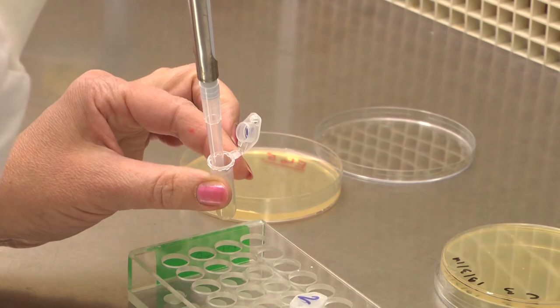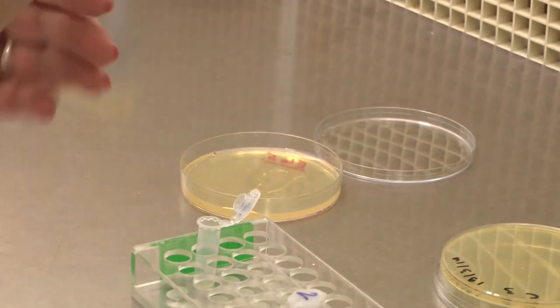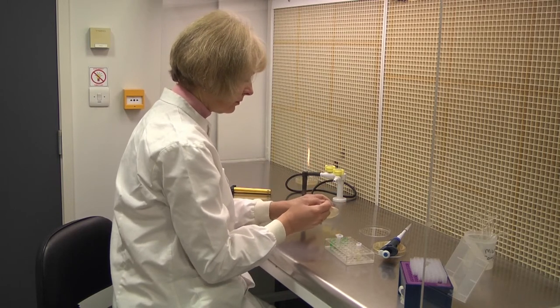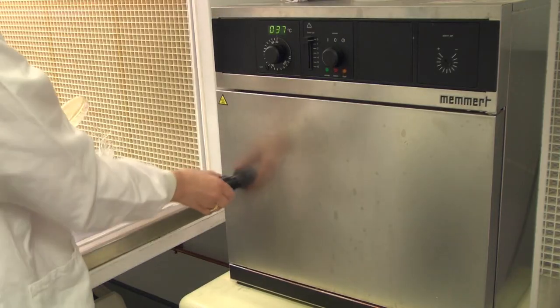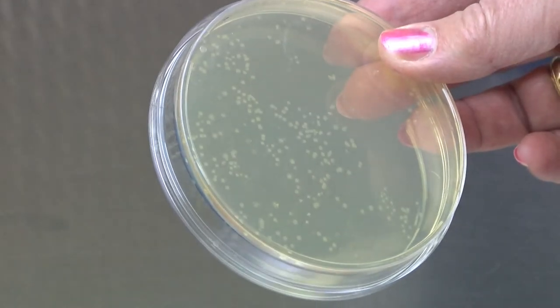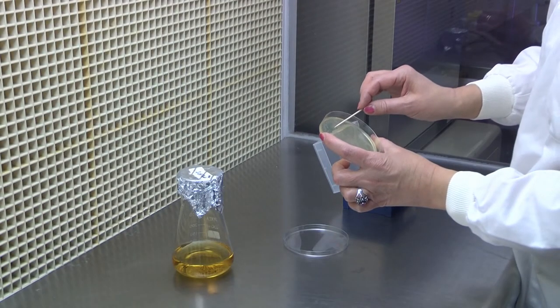The individual DNA fragments are then purified and cloned into a vector which allows us to introduce them into Agrobacterium, a natural soil-borne bacteria that introduces DNA into plants. The bacteria containing our algal genes grow overnight and we can pick the colonies that contain these algal genes and grow them in liquid culture to help us move them into our plants.